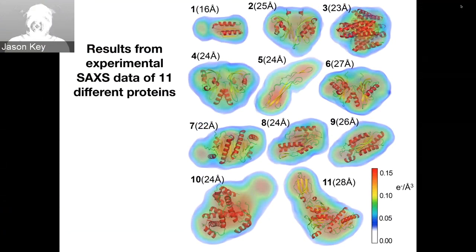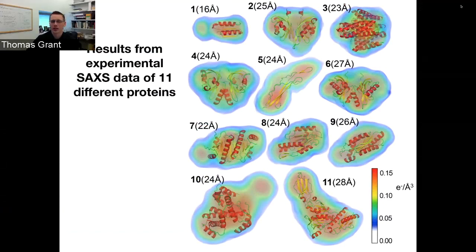One of the things that I'm working on now is, there's a tool in DENSS now where you can calculate what the density from a structure is. It'll use a Fourier transform and attempt to clean up all the truncation ripples to calculate what the density is from a structure that actually matches your SAXS data. Because typically, if you calculate the density from a structure with normal Gaussian approximations, it doesn't look like what the scattering profile is. But if you use a Fourier transform, it does.